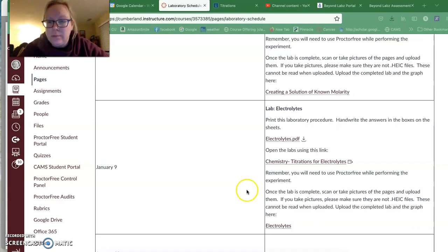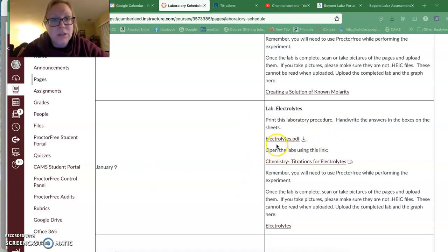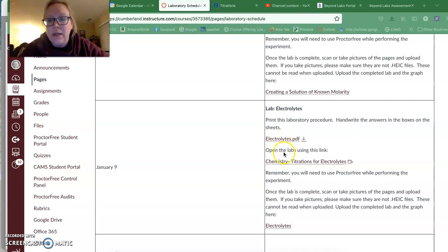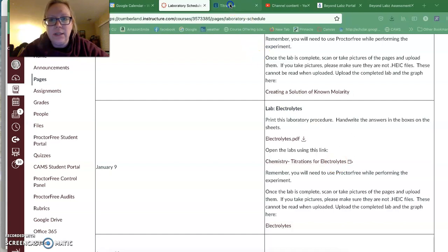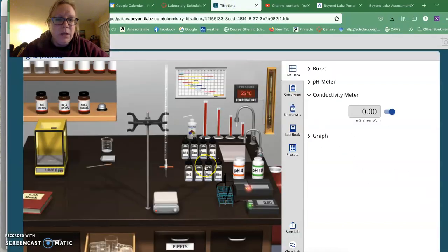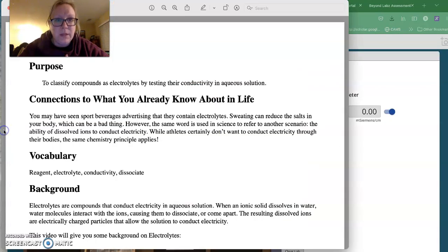So here is on Canvas, our front page. There's a link to our electrolytes, and then you're going to open up this chemistry titrations for electrolytes. It's a titration window that you have seen before.